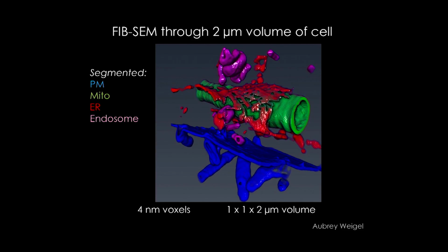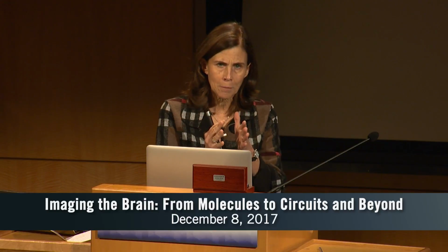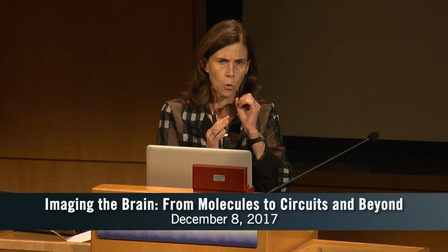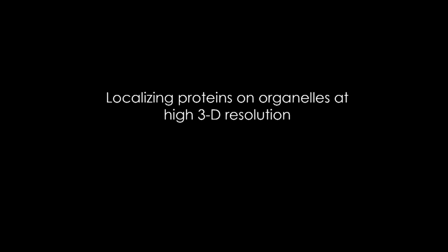Now, the mitochondria that you can see here in green are intimately communicating with the ER, which is shown in red, and there's a lot of crosstalk between these two organelles that's absolutely critical for calcium handling in the cell, for reactive oxygen exchange, as well as lipid and other types of communication. Well, how do we localize proteins on these organelles?